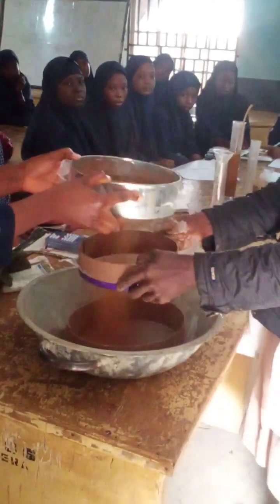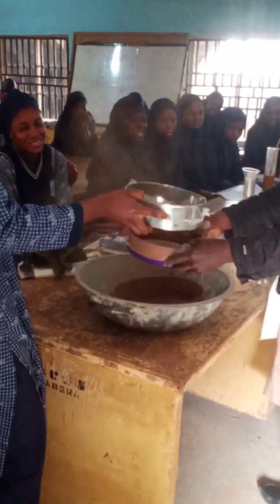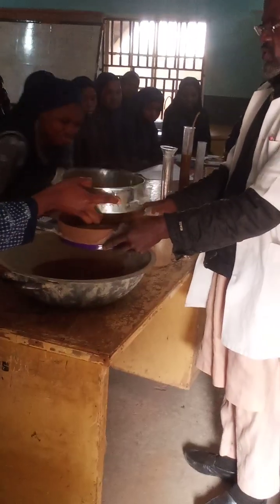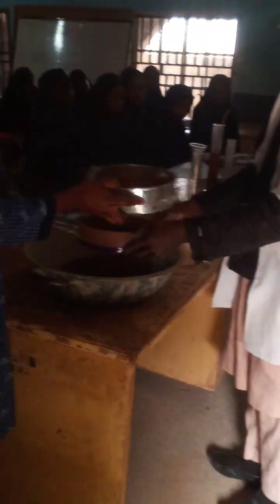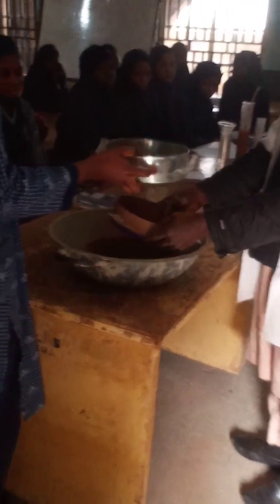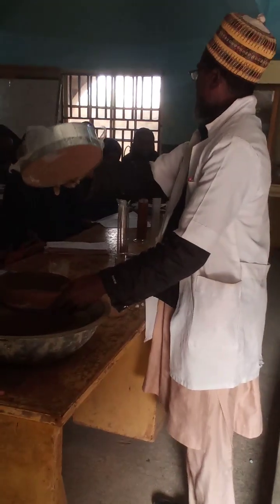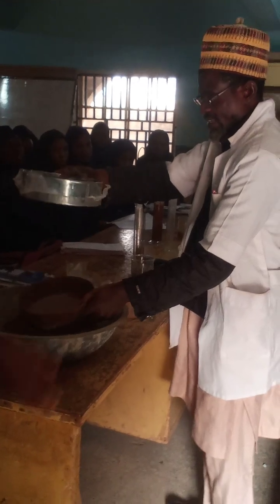Keep on sieve. You can see. This is what's called the sieving method. It's also used to determine the particle size of a soil sample. Okay? You can see, we discovered that the particles of larger size were held by this sieve. Look at it. They cannot pass through beyond this level.